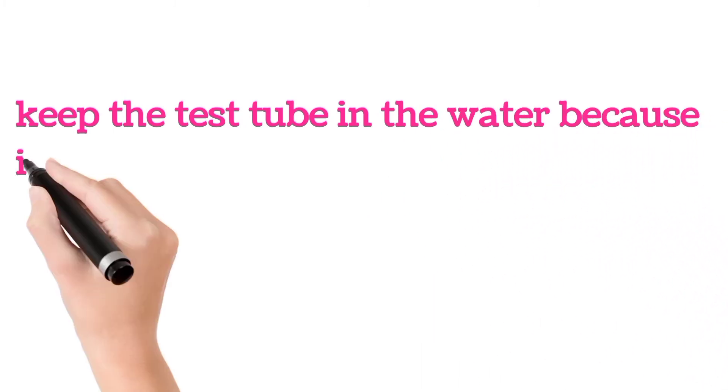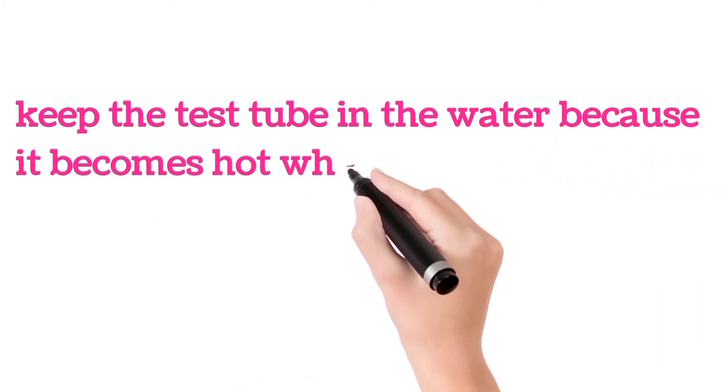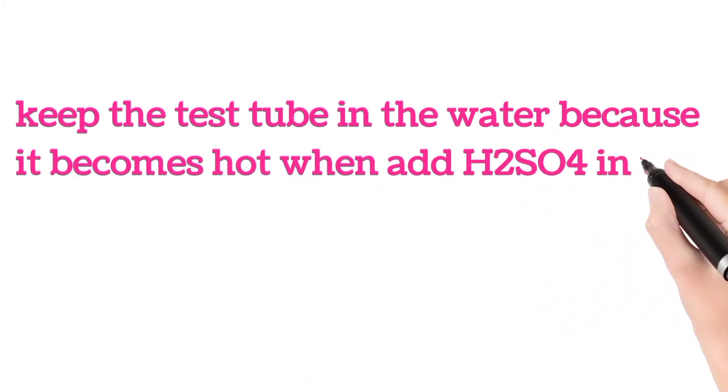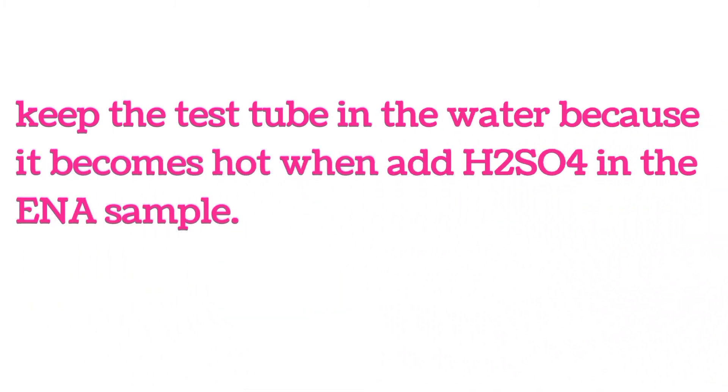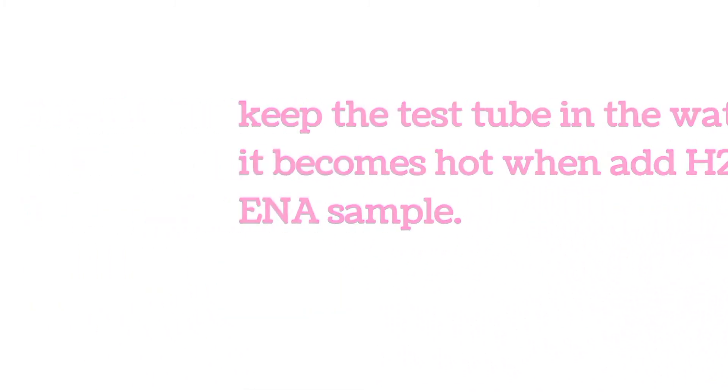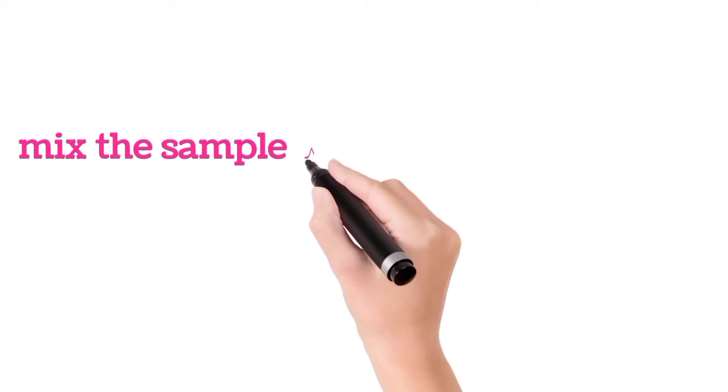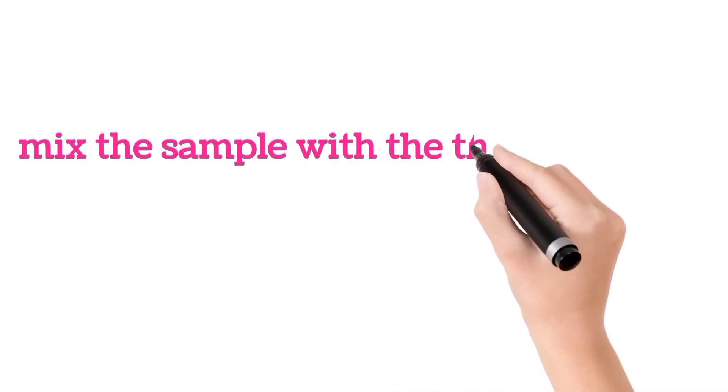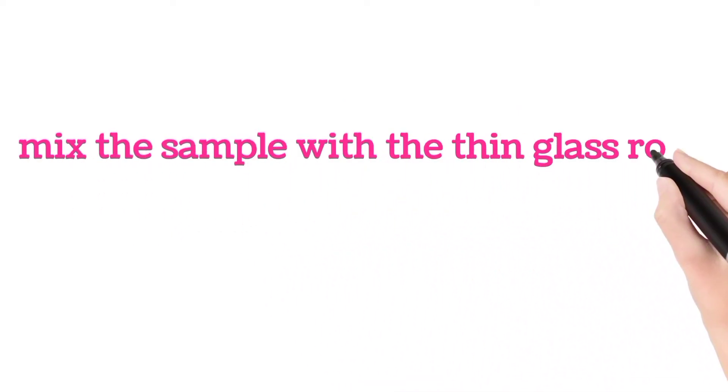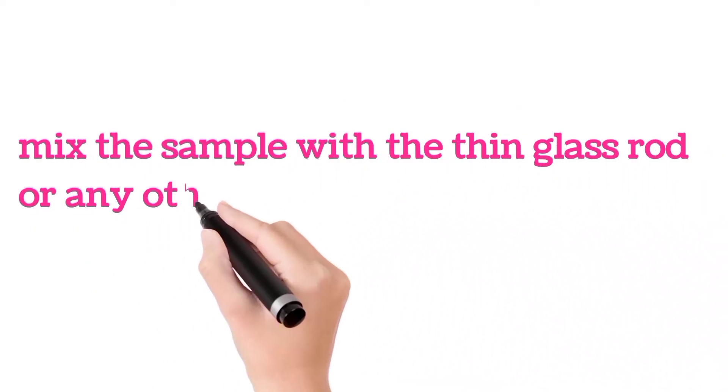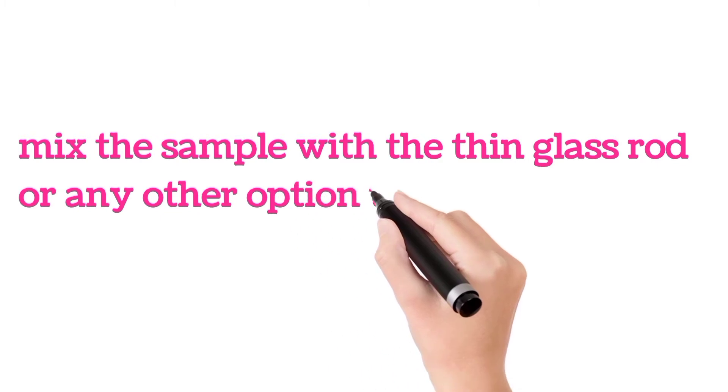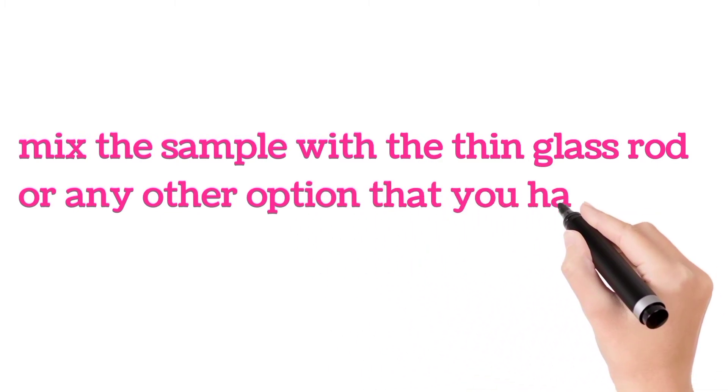Keep the test tube in the water because it becomes hot when you add H2SO4 to the ENA sample. Mix the sample with a thin glass rod or any other option that you have.